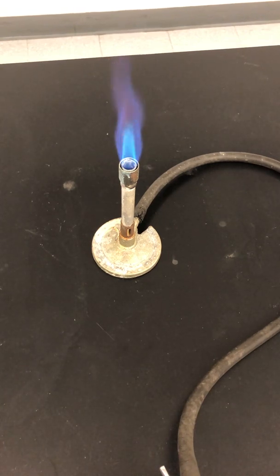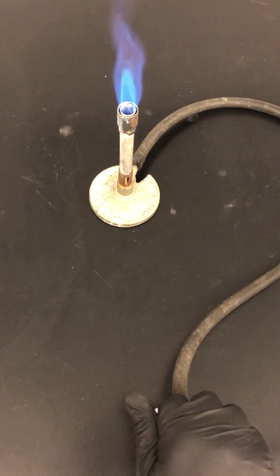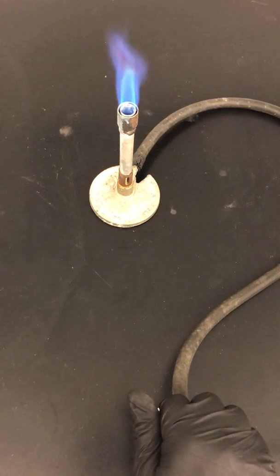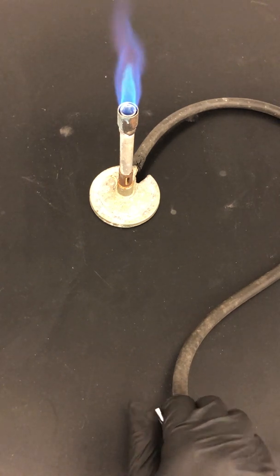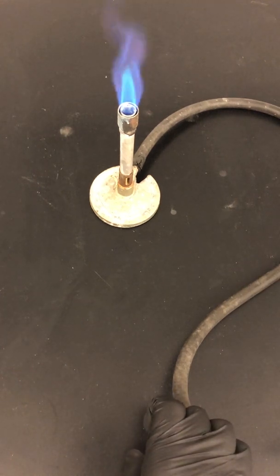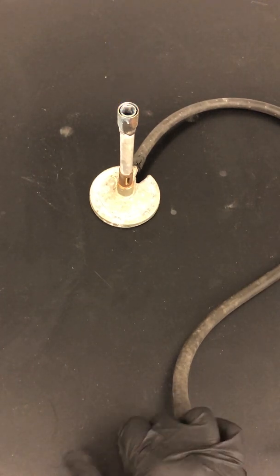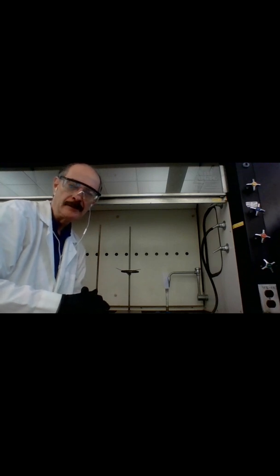If the flame goes out while you're still working, don't try to relight it right away. Turn off the gas, let it vent, then start again. In case of an accident, there is a master gas valve underneath the instructor's bench that can shut down the gas for the whole lab. I'll turn it off and then we'll get started with our experiment.